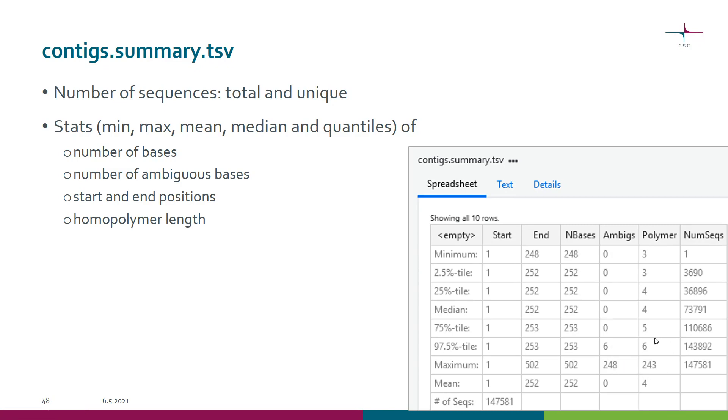There is also the homopolymer length. In this particular set the longest homopolymer is 243 long - again something we probably want to remove.